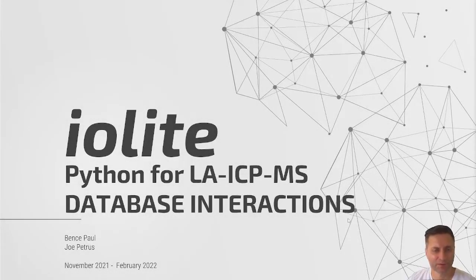Hi, and welcome to this week's presentation as part of IOLITE's Python for LA-ICP-MS course. In this week, we'll be discussing database interactions and how to access data in the database via IOLITE's Python API.